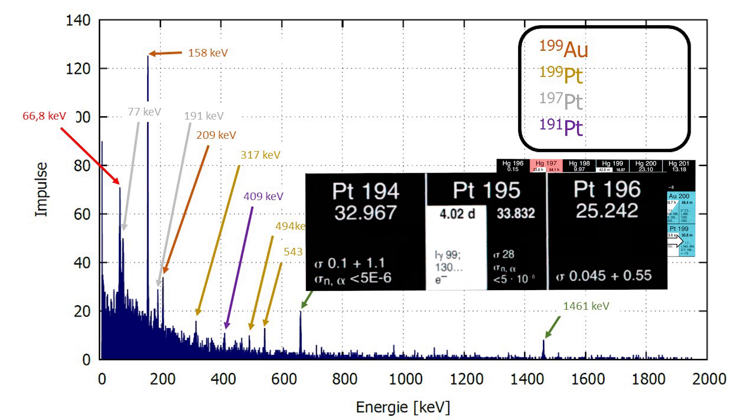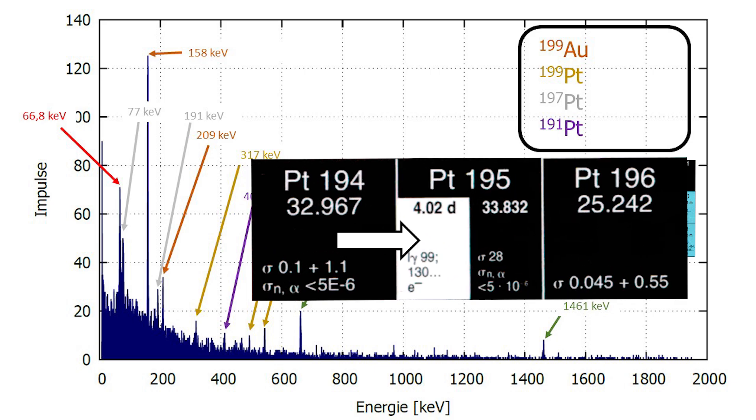If platinum 194 captures a neutron, radioactive platinum 195M may be produced. This makes an isomeric transition by emitting gamma photons. Unfortunately, it was not possible to recognize these transitions in the spectrum, even if, according to the occurrence probability of 11.1%, it should be sufficient. I don't know what happened there.